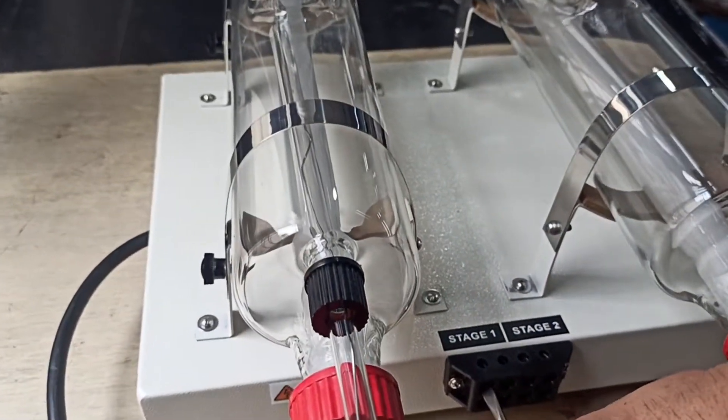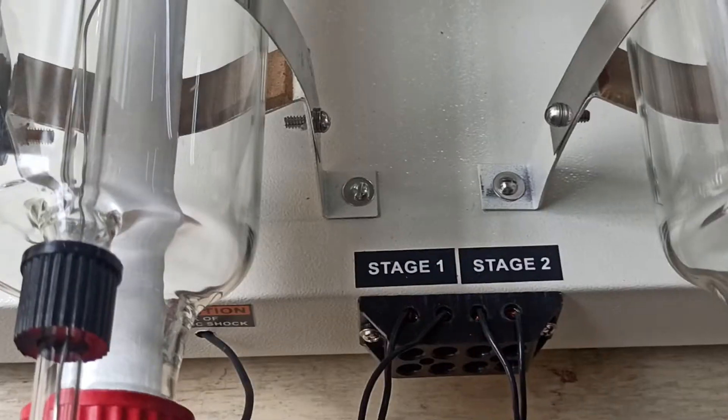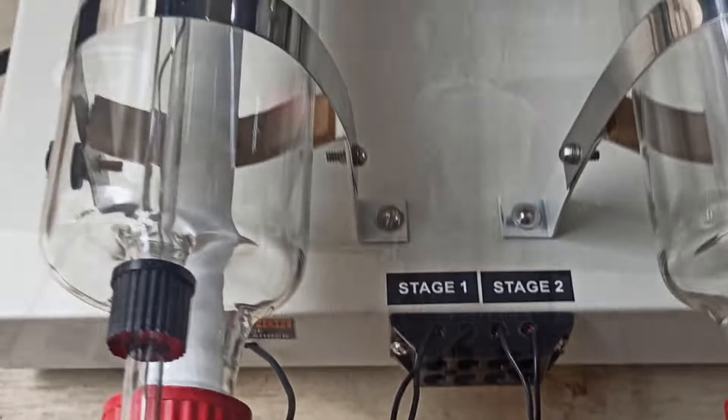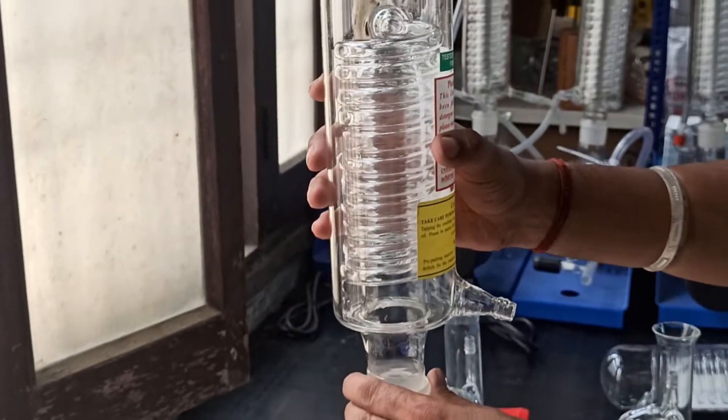Connect the heater wires on the given stage one and stage two points with a screwdriver. Now attach the condenser unit to both the boiling chambers.